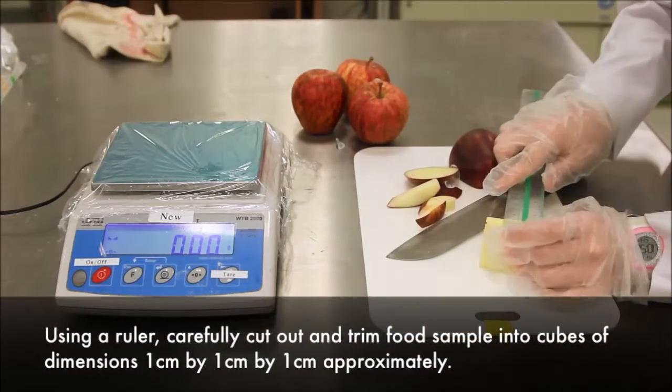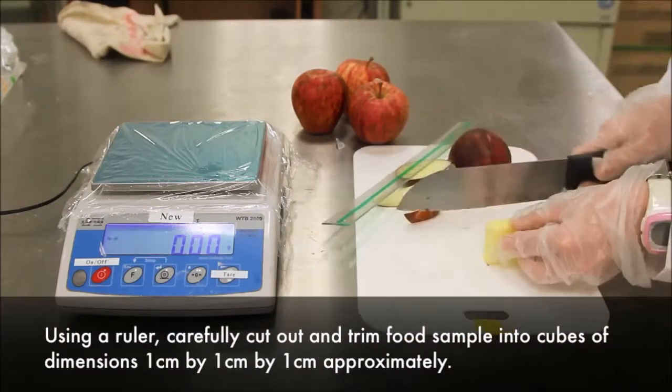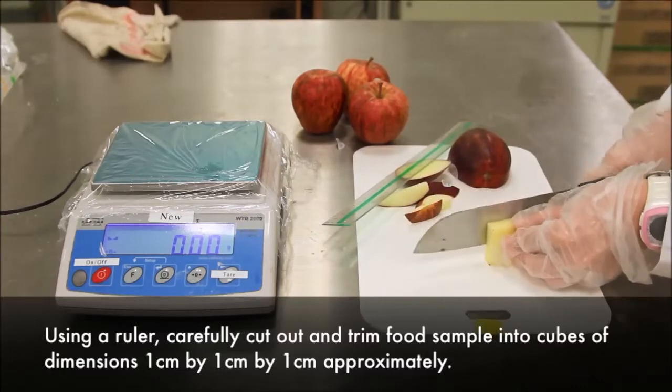Using a ruler, carefully cut out and trim the fruit sample into cubes of dimensions 1 cm by 1 cm by 1 cm approximately.